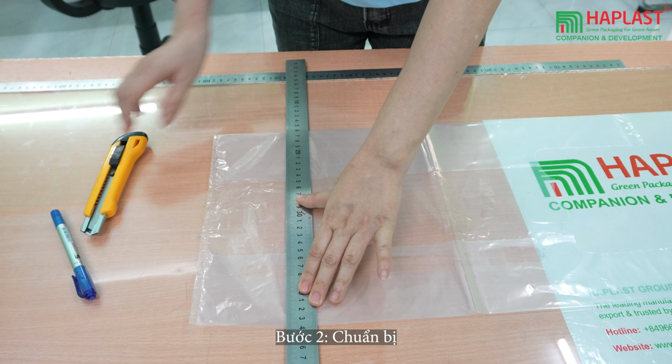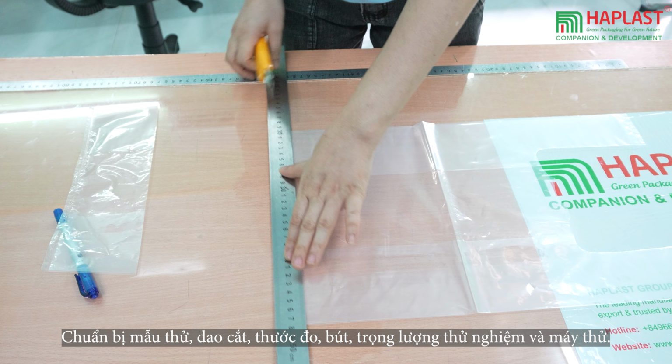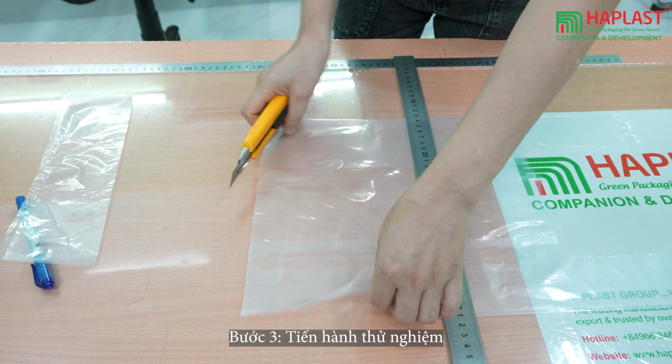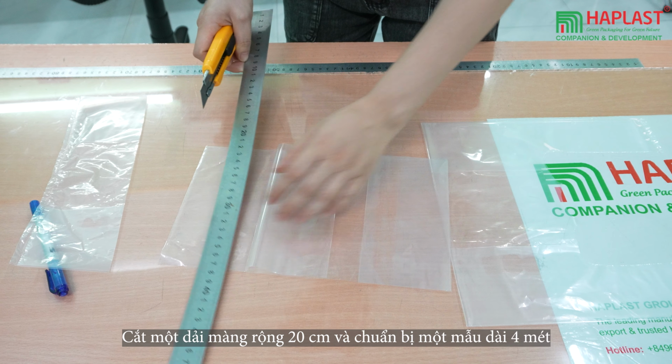Step 2. Preparation. Prepare the test sample, cutter, ruler, pen, test weight, and testing machine. Step 3. Conducting the test. Cut a 20-centimeter strip of film and prepare a 4-meter long sample.